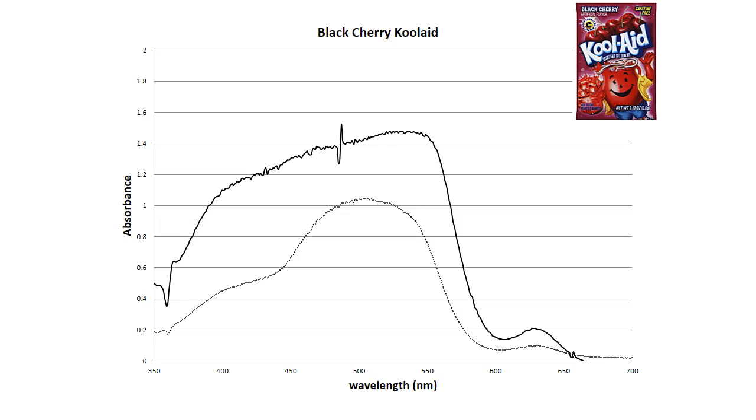So this first peak at about 500 nanometers, the big broad peak, is completely useless in the big jagged solid line sample because it goes beyond the limit of the spectrophotometer. Whenever the peak gets noisy and jagged looking like that at the top, it's not really usable. It's only when the peak is nice and smooth looking that you can really use it. And that's just because we've gone beyond the limits of the spectrophotometer. All instrumentation has limits, and you can't exceed the limit of the instrument. But I did want to get a bigger peak for that sample on the right.